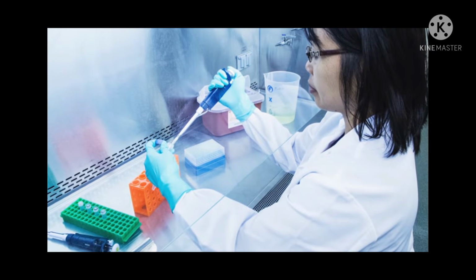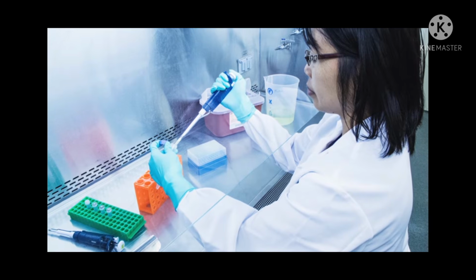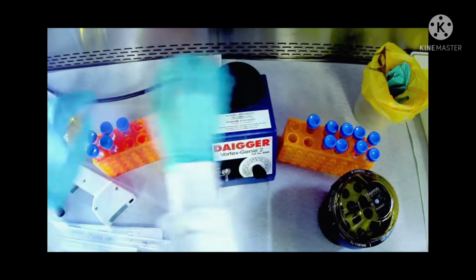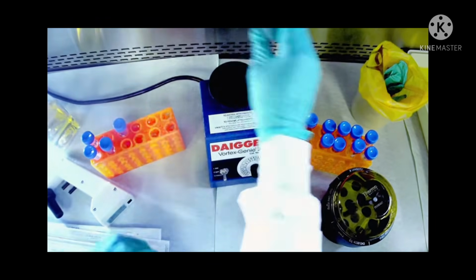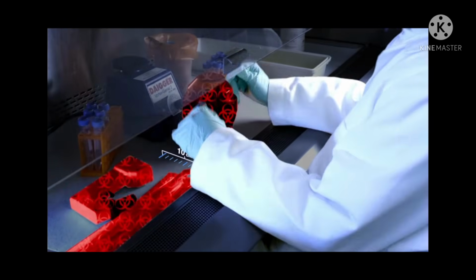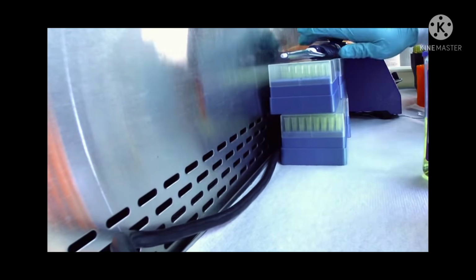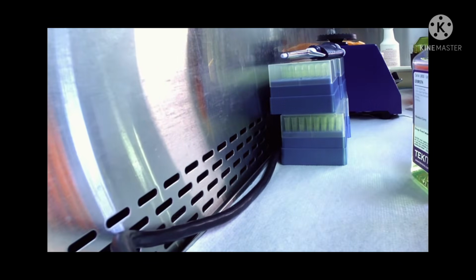3. Place your chair at a comfortable height and in the middle of your workspace to ensure you can reach everything you need inside the cabinet without discomfort. Please keep in mind that you must work at least 10 centimeters inside the BSC. To guarantee uninterrupted airflow, cabinets should never be overcrowded.